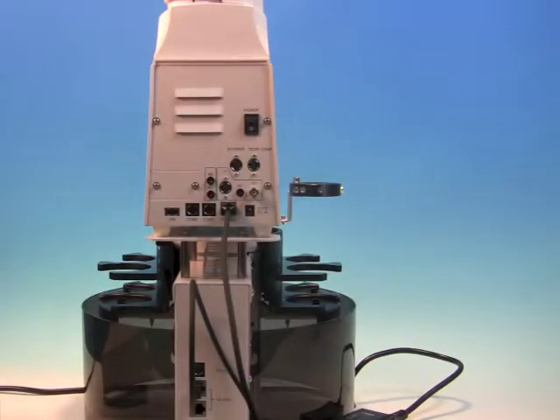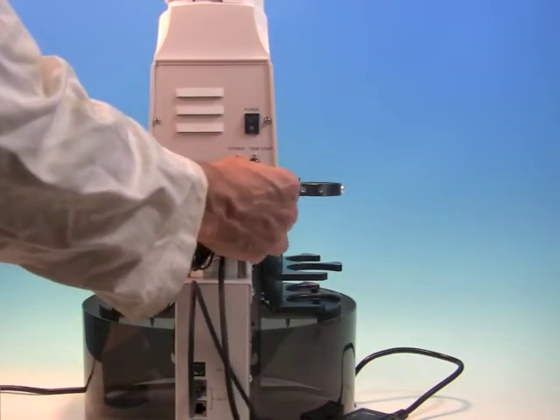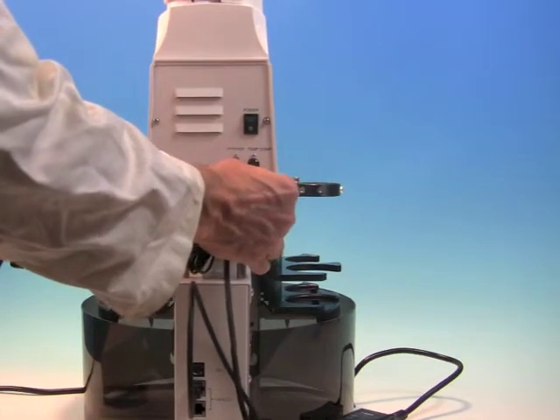Unlike some other titrators, the preamp comes pre-installed in the titrator at the factory.